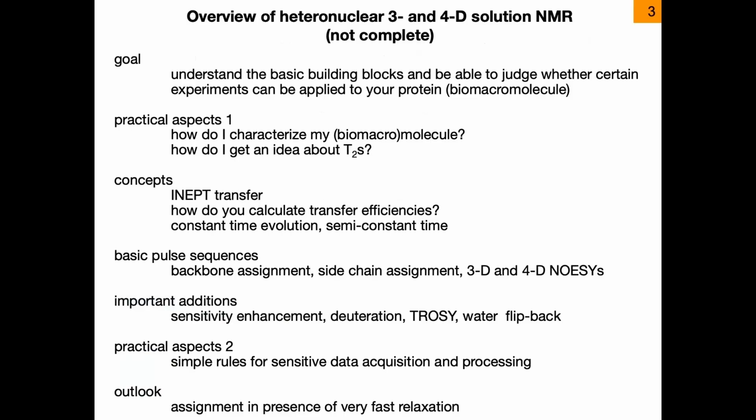So I want to show and explain to you the basic building blocks of these experiments and, very importantly, show how you can quantitatively analyze the experiments, so that in the end you may see for yourself whether a certain experiment is useful for your problem and whether maybe you can modify the sequence to get a better result. So I will show you a couple of practical aspects.